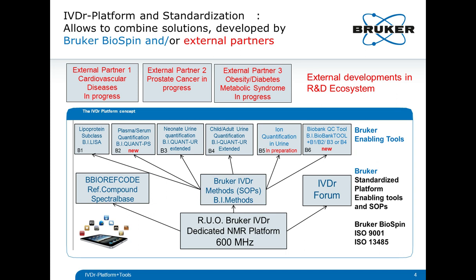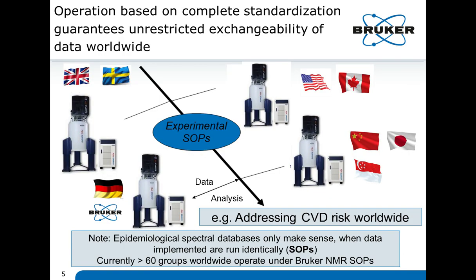You see here an iPad because this is the concept that we are following. We have a fixed hardware platform and we have a fixed interface definition for how applications are talking to this whole system. And therefore we have the same concept, to be able to have multiple solutions on an instrument to make sure that this instrument can work very efficiently. So what does that mean?